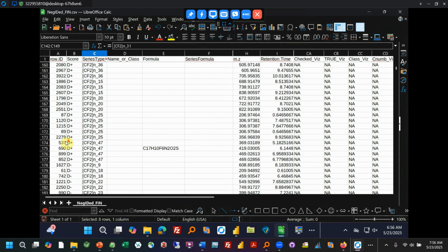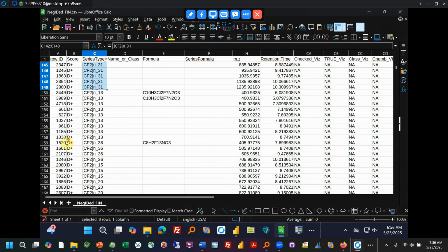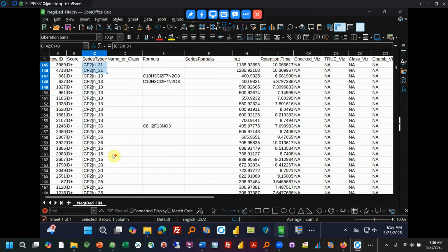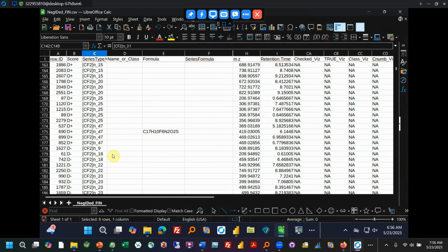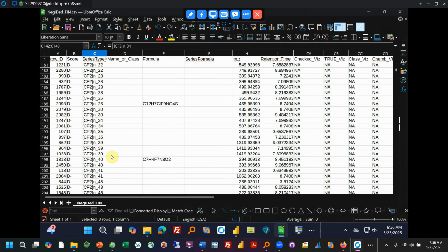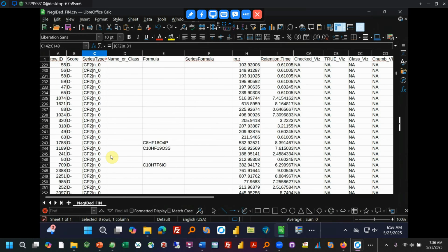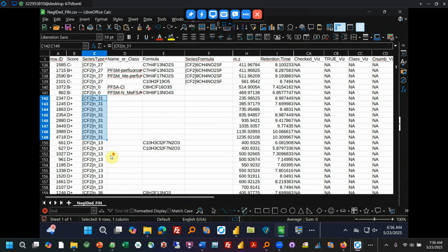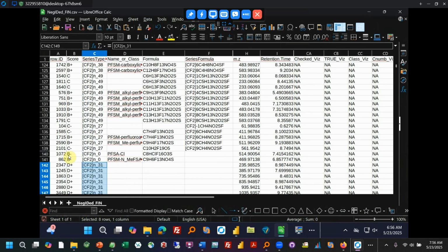But you don't know what their structure is going to be. Some might have formula prediction, but most probably won't. And then you could keep going down. So in our case, especially with something so rich in PFAS, I might stop here at the B minuses. But if I had more time, I could do D pluses.